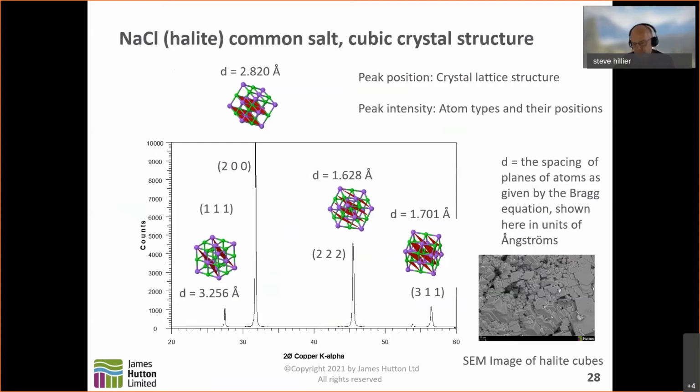The properties of chemical compounds obviously depend on their structure and composition as well. So if a chemical analysis identified a substance as containing, for example, just iron and oxygen, we wouldn't necessarily know exactly what it is. We might be left wondering which of half a dozen iron oxides, for example, it might be. But XRD would tell us exactly which one it is. Very, very fundamental measurement technique, if you like, or measurement probe.